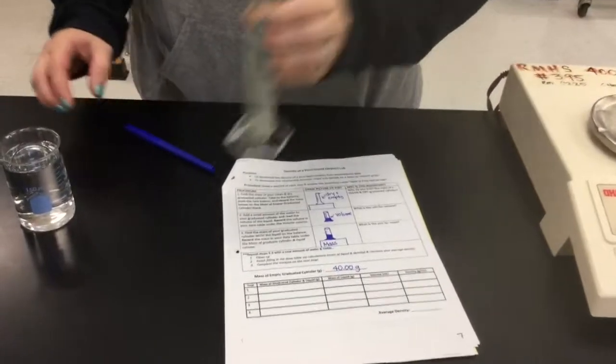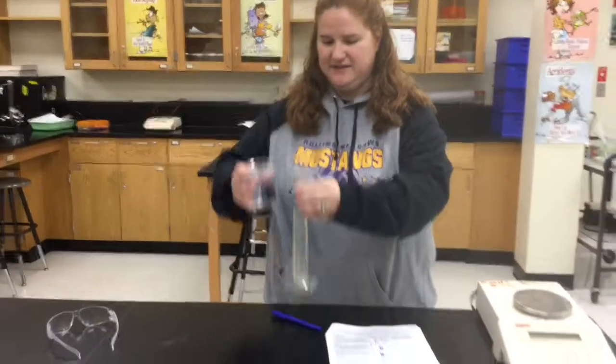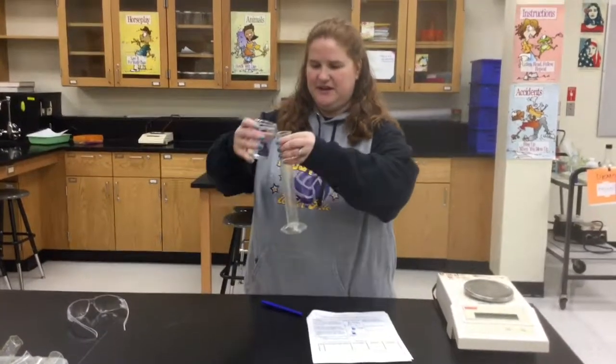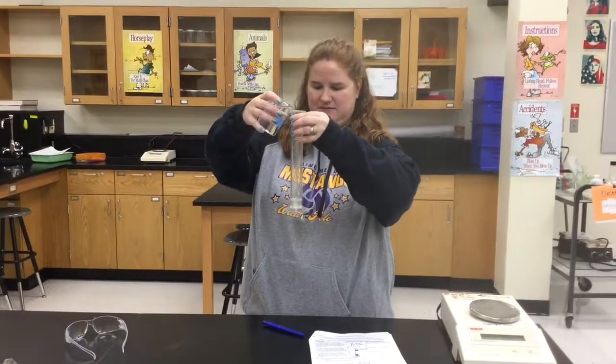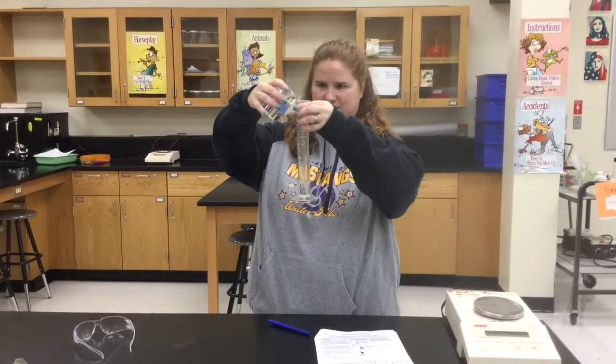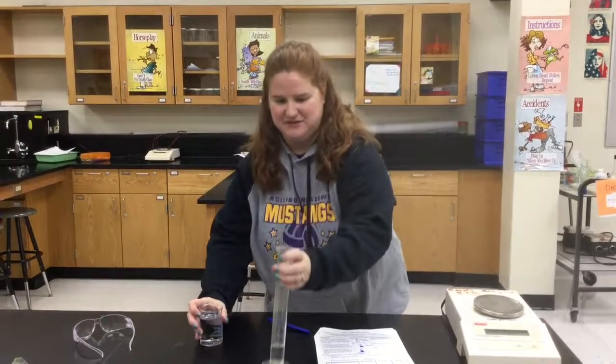Okay, so now I'm going to put a small amount of water. Does it matter? I just want each trial to be different. Right. So, I would probably start small. Space them out. I'm going to start with 20. Or try to start with 20-ish, because we'll read the exact amount. Okay, it's actually 19. That's okay.